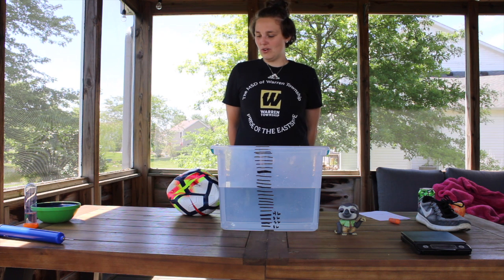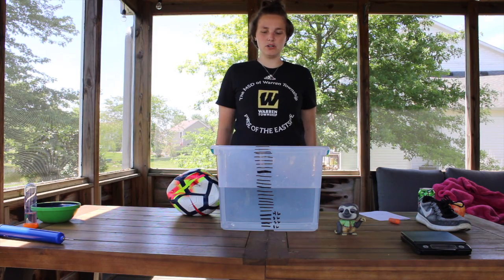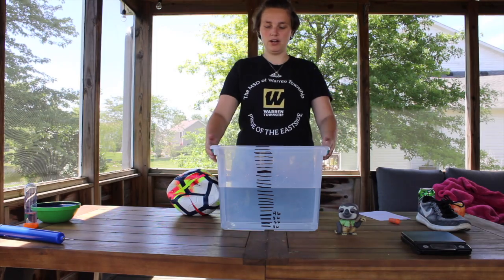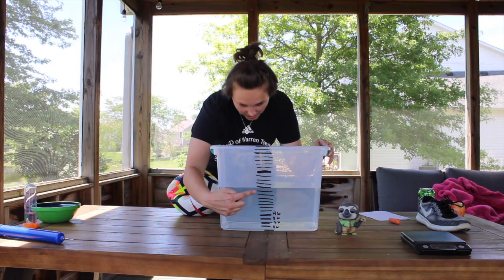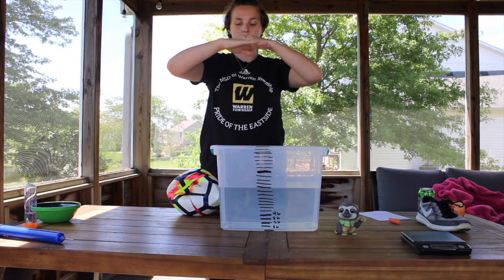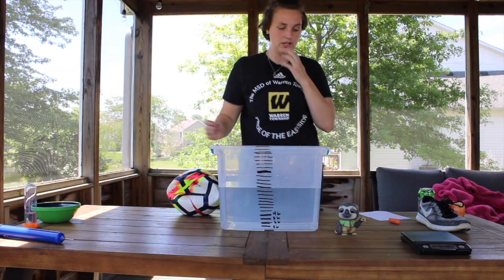Alright, so we're going to do a lab today about volume and mass, and we're going to start with volume first. So first off, I have this tub of water, and you can see the different lines. Each of these lines equals 1 liter. So we are currently at 12 liters. You can see it right here. It's called the meniscus of the water, and that's where the water meets the line. And so that's how we know how far up it is. So it's currently at 12 liters.